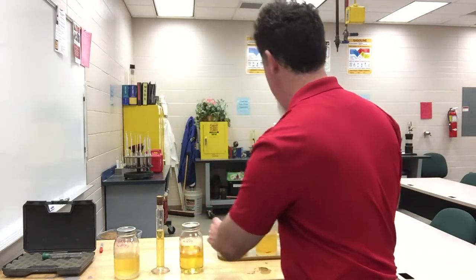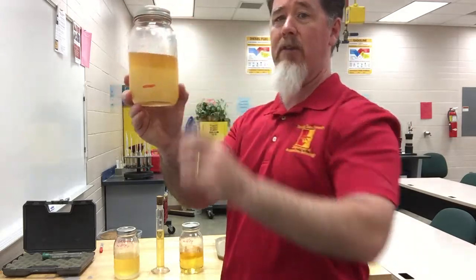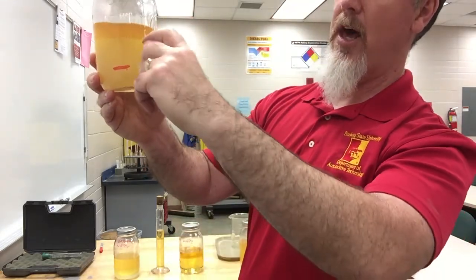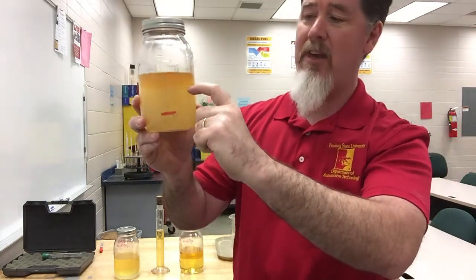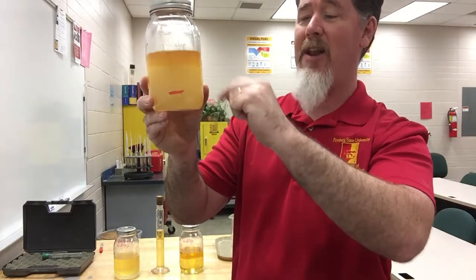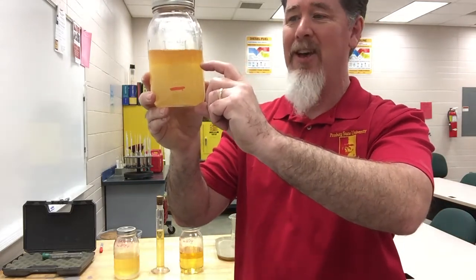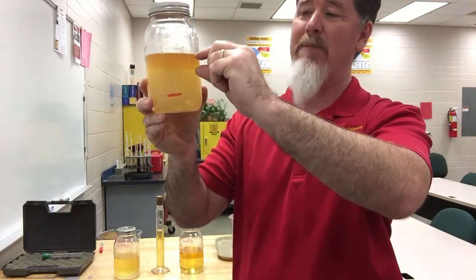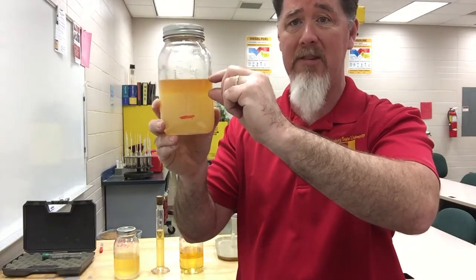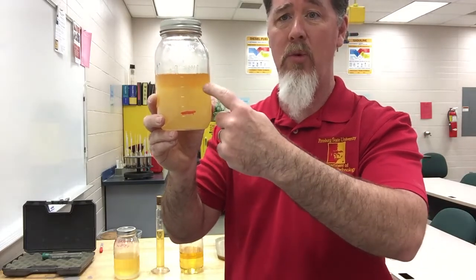As I take a look at my 2 samples and see what we have here, this one right here, I could already see separation take place. I could already see a line. If we let this settle for a while, it'll be much clearer. But at this particular level, I don't have to start doing any type of measurements, because I know that, hey, that was E85. Over half of it, over 3/4 of it was alcohol, and maybe 1/4 of it or so was gasoline. So that's pretty obvious. Again, you can see my line down here at the bottom, that was water, and how it went up from there.